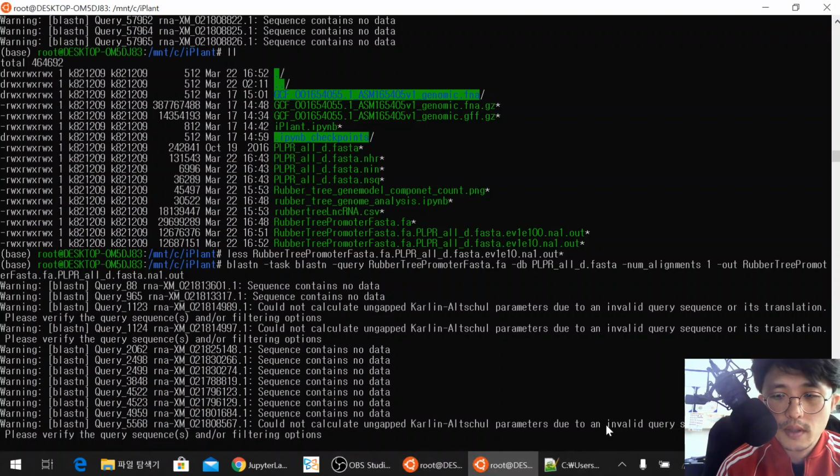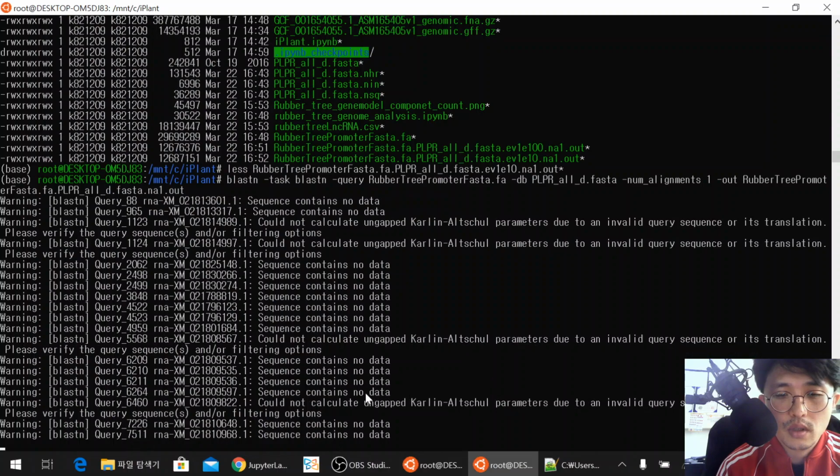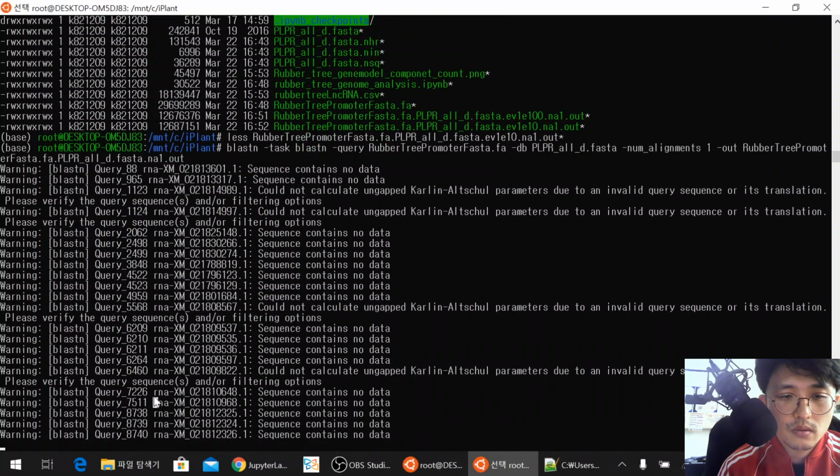What does that mean? The invalid query sequence. I don't know why it produced this error message. Let me check what happened there.